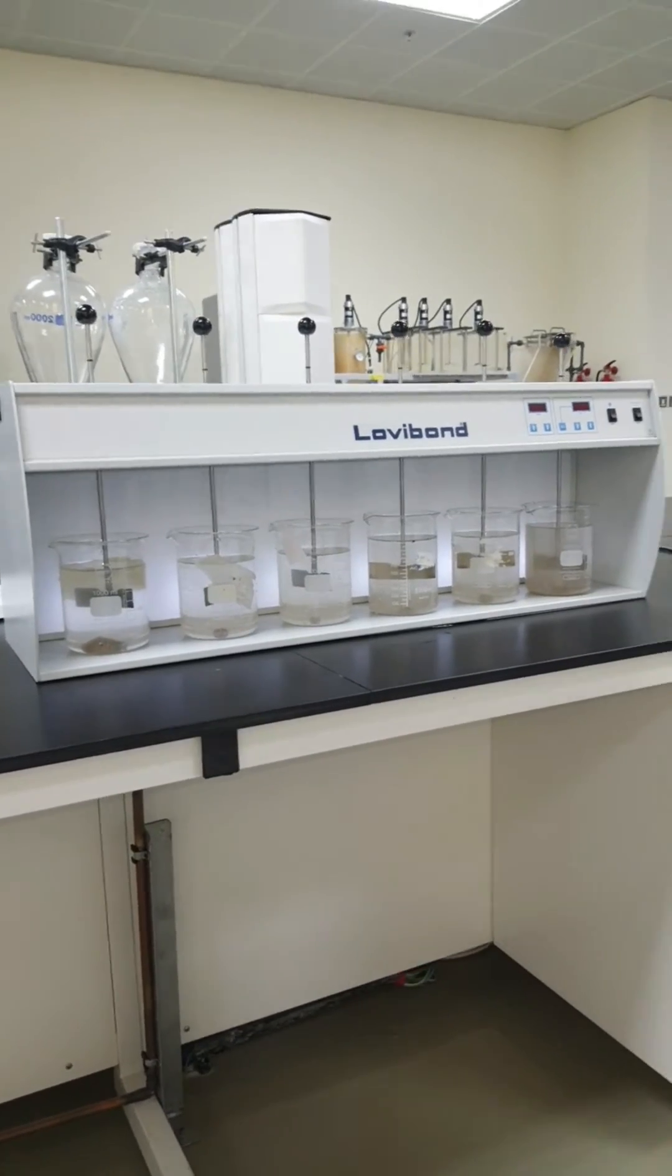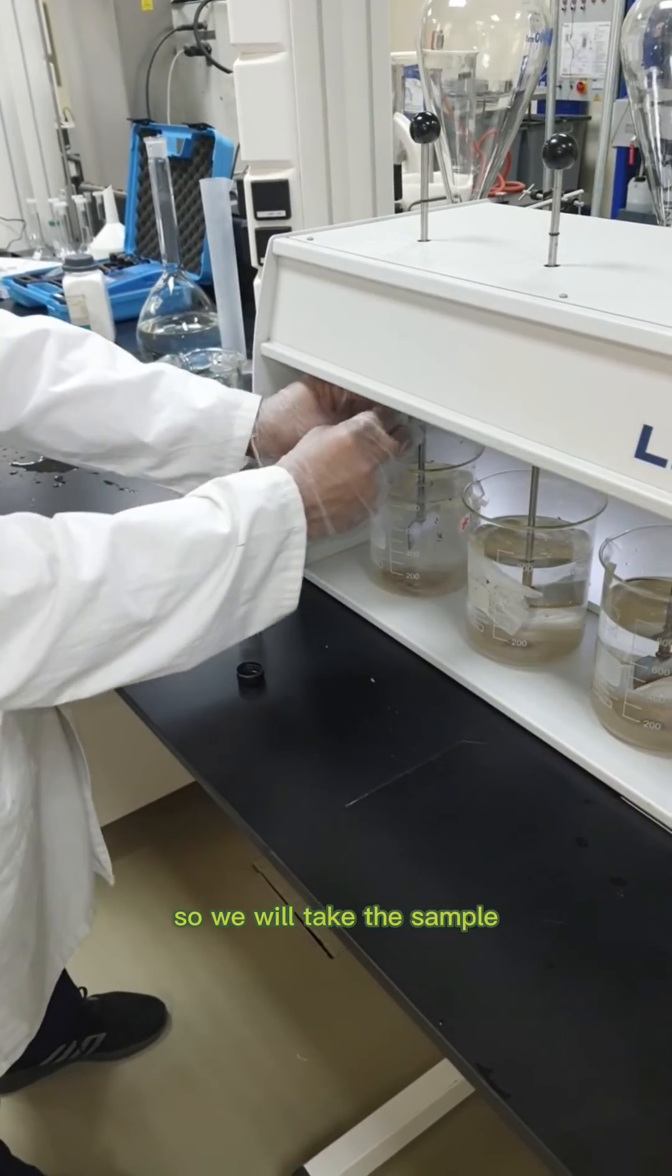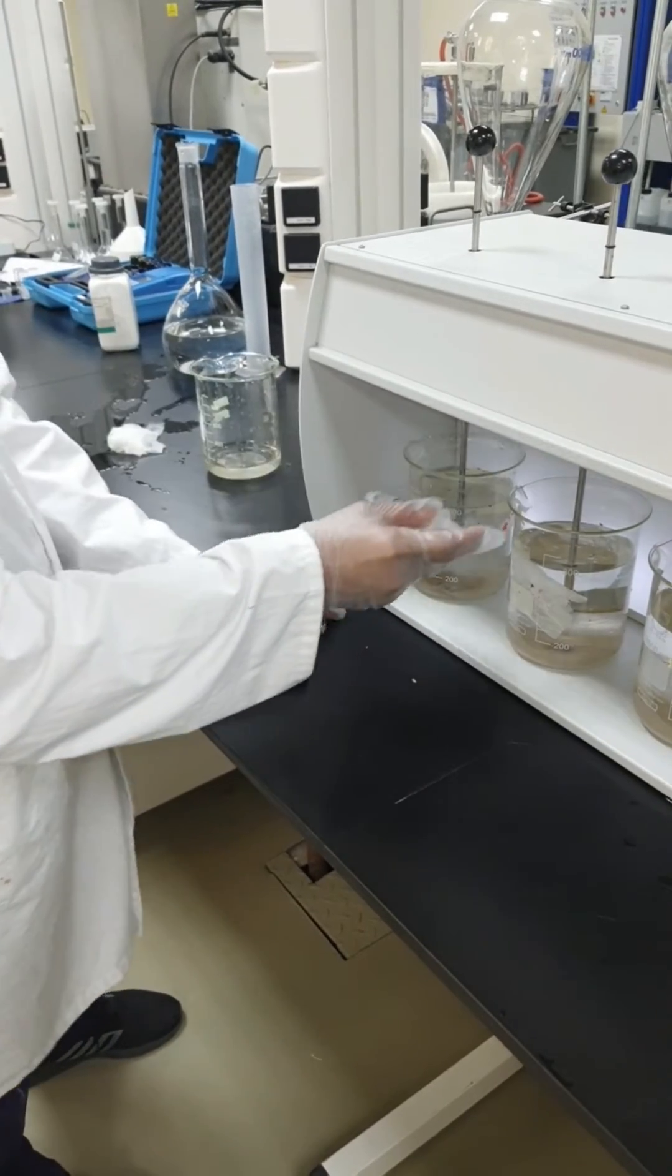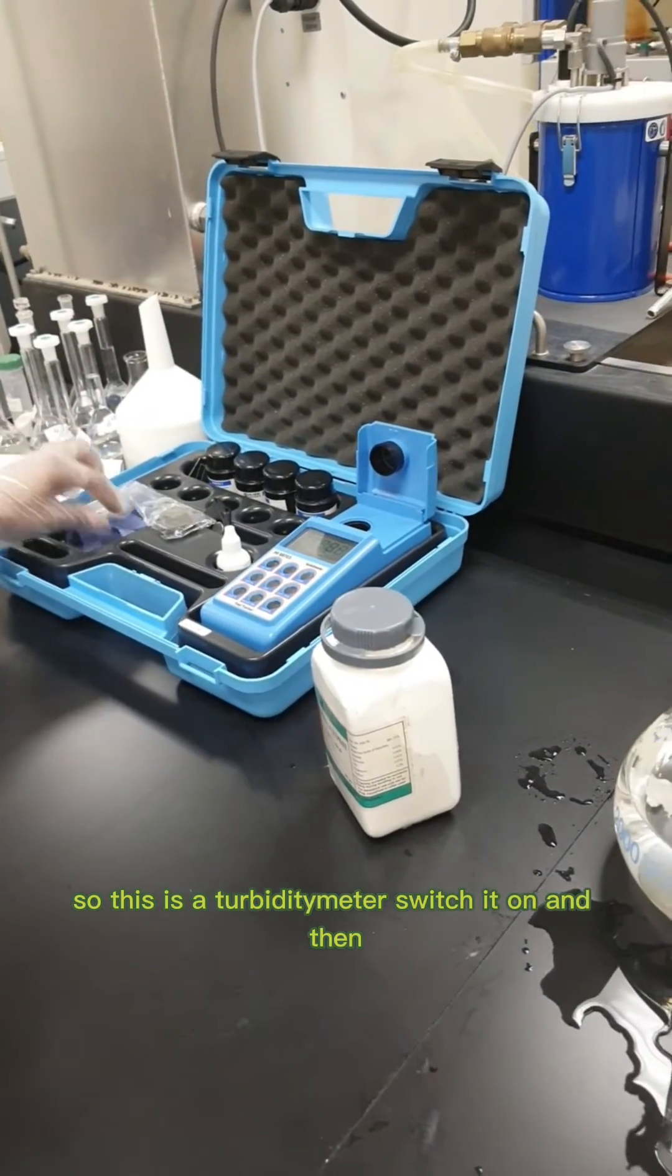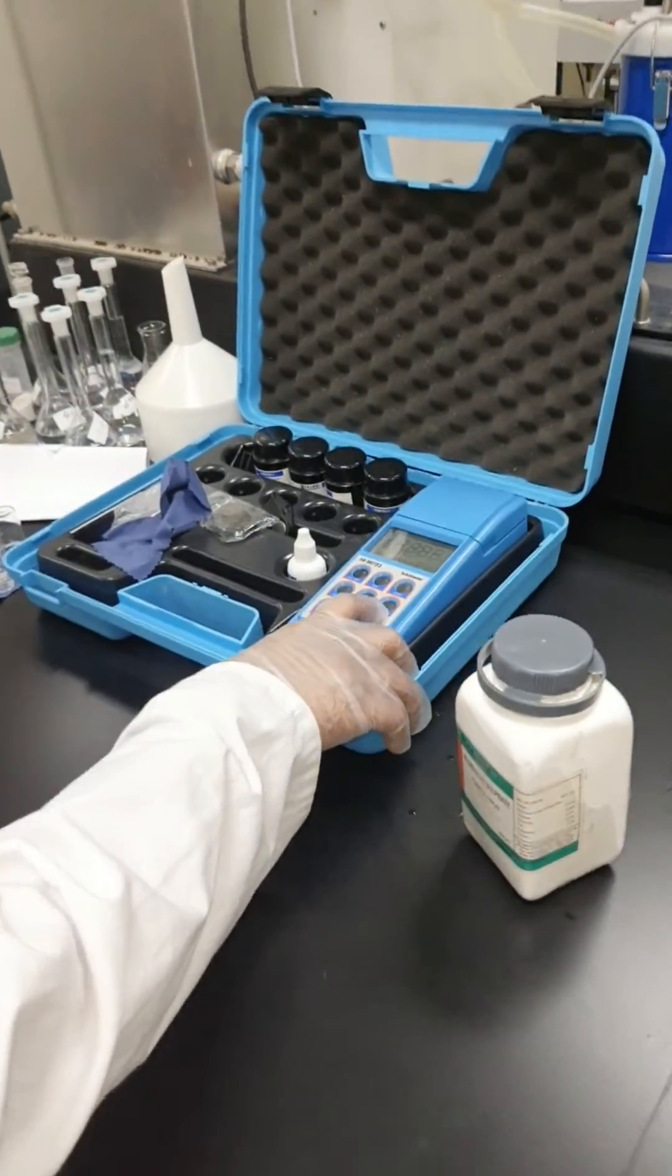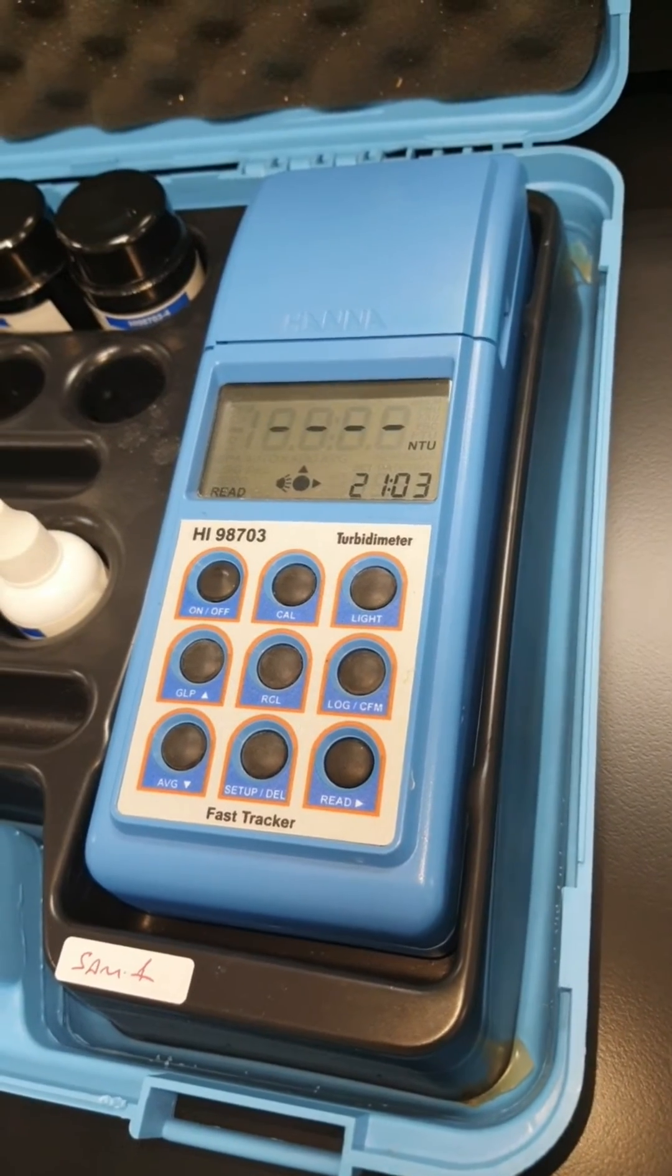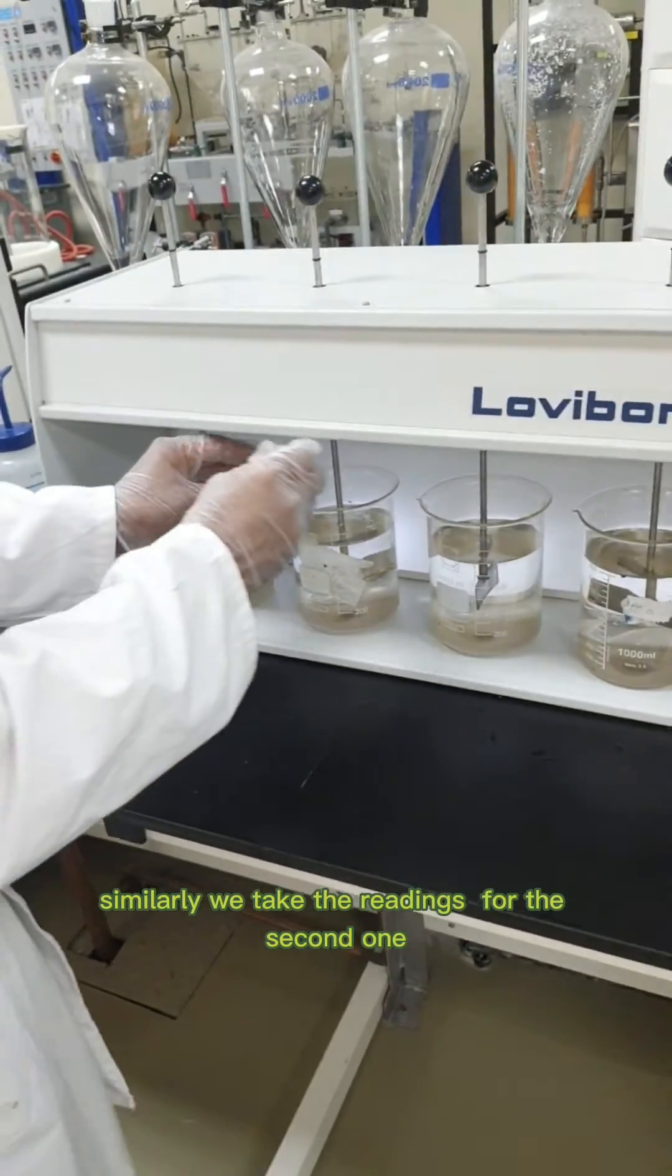Now we will take the samples. This is our reference one. We will take the sample carefully so the liquid is not disturbed. Switch it on and take the reading. This is around 47.4 NTU. We will take the turbidity for the second one.